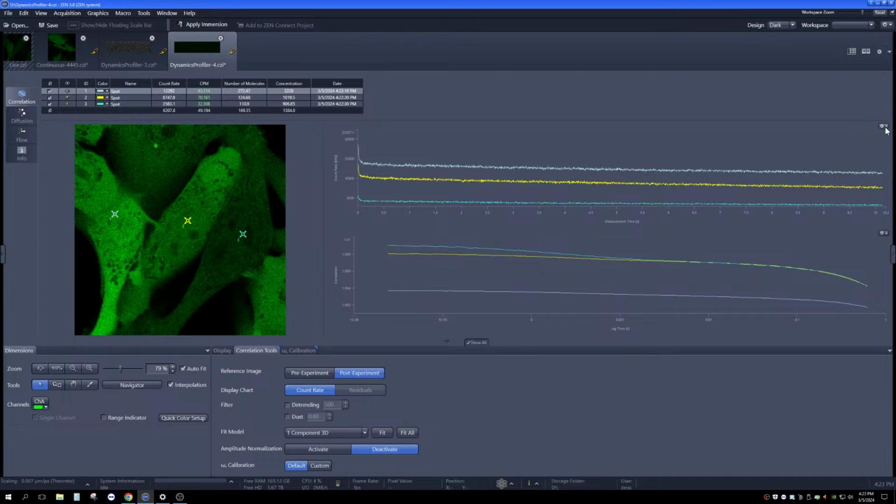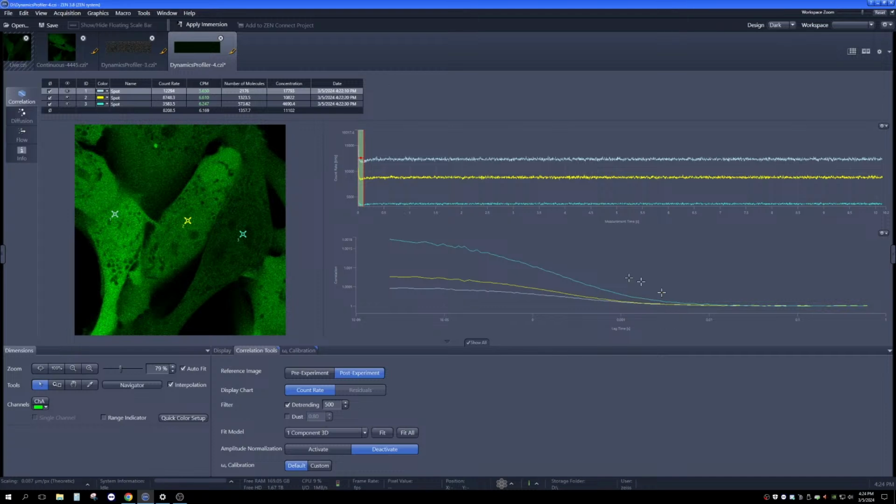So a couple of things that are really nice. You can see, as expected, we have a teeny bit of bleaching here at the onset. But if you don't want to count that as part of your actual measurements, you can just remove that region. Okay, so we don't have to include that in our measurements, and it's very easy to adjust this. You can also delete that if you change your mind later. Because these are not actually flattening out to basically 1, we can use detrending here, which is a pretty common thing you'll have to do in any sort of live biological systems you're measuring.